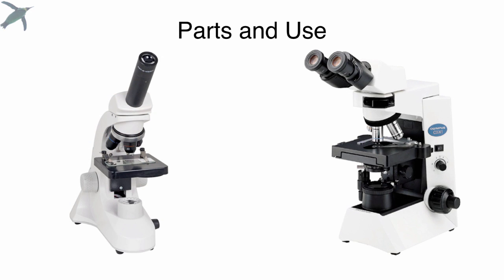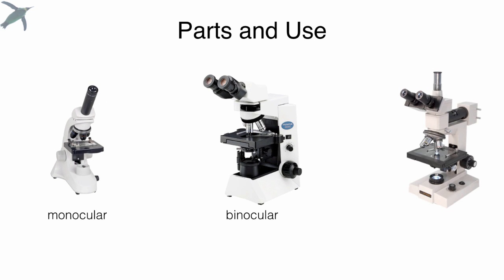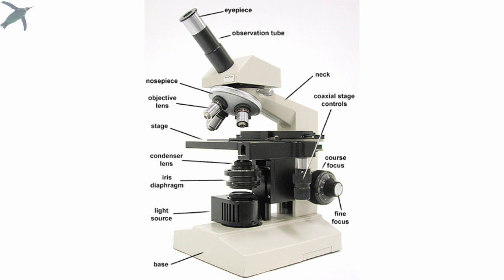These are compound microscopes. Depending upon what kind of scope you have, it'll look something like this. You may have one eyepiece, we call those monocular. If you've got two, those are binocular. There are actually trinocular scopes. That is for your third eye. No, it's for a camera.